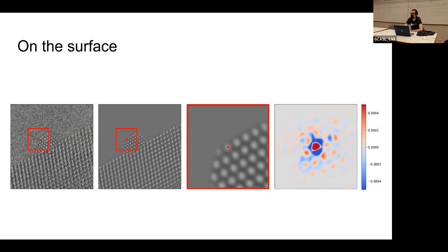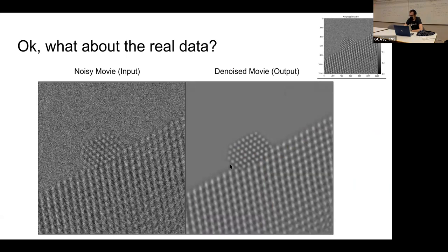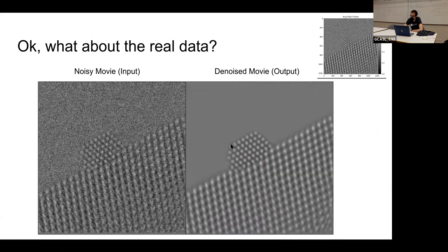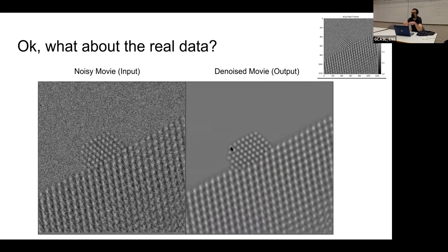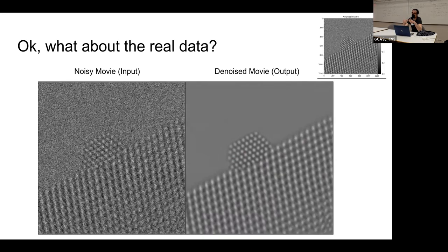Yeah. So why did they want these kind of images? Like even the final images don't seem so useful to me. The result. Oh, the result, okay. So what do they want the result for? Yeah. Because then they look at this and they say, okay, this atom is jumping at this particular time, which means that the 3D structure, like the nanoparticle, is actually changing. And that allows them to understand what is happening during a chemical reaction.